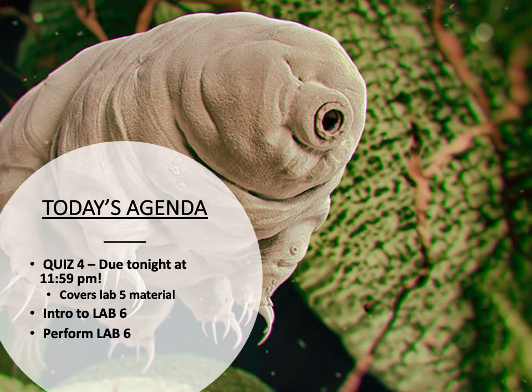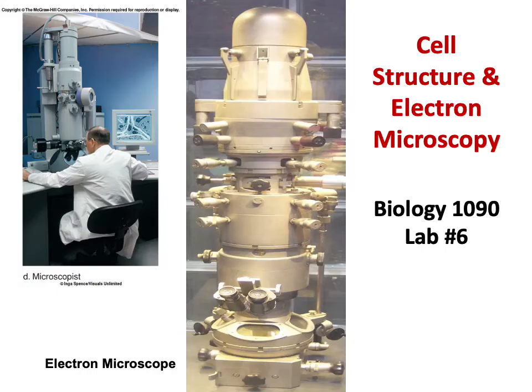6, we will be getting back into the microscope, and you guys are going to actually be looking at structures within the cells and measuring their size. Before we get into the introductory material for this lab, make sure that you are finishing that quiz. It covers lab 5 material. So let's go ahead and get into our introductory stuff.